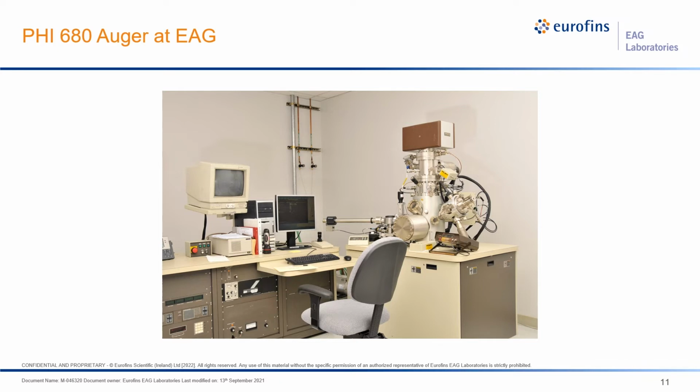Note that this arrangement leaves the 3 important axes for analysis in one plane. And this coplanarity geometry helps us to examine samples which have challenging geometries that would prove difficult for other techniques. This whole thing is in an ultra high vacuum chamber, typically in the 10 to the minus 9 to 10 to the minus 10 torr range.